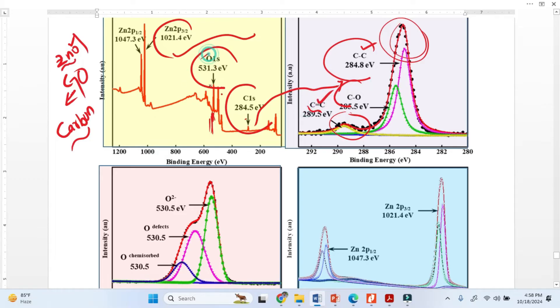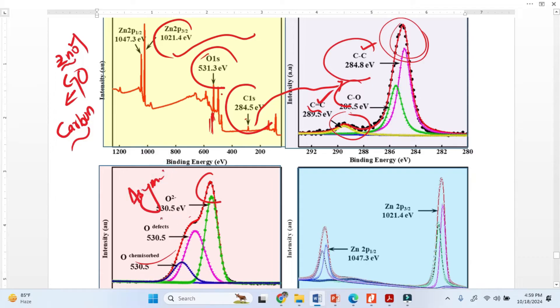Similarly, the oxygen peak — we expand it and resolve it with the high-resolution spectra. We get some peaks here and an asymmetric peak. This asymmetry in the oxygen peak gives us a lot of information about defects and chemisorption.